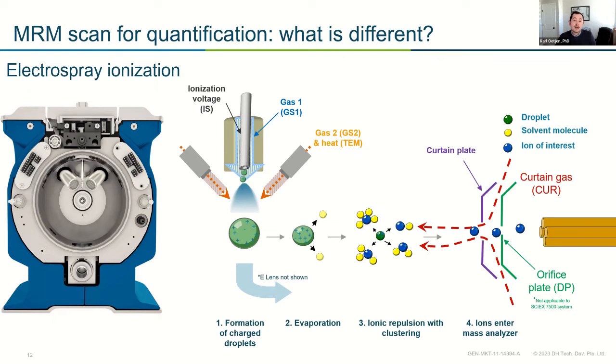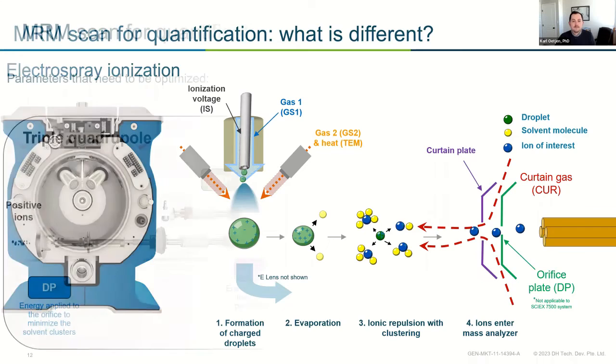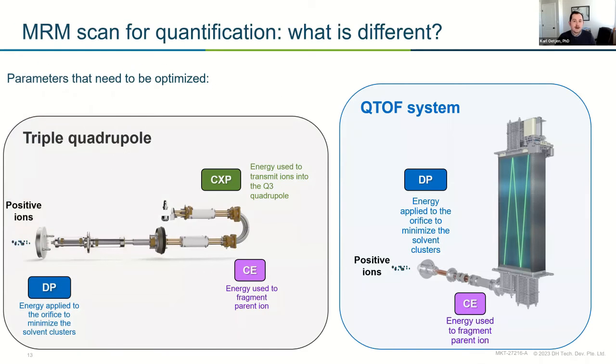If you want to dive into how to optimize those, all that kind of good stuff, check out the nominal mass series, because we go into a lot of detail there. But based on the poll results, you seem to feel pretty comfortable with that, and more concerned about what makes it different. So let's say our ions have now made it through our source. They're either about to be introduced or introduced into our instrument. What other variables are there, and what do I need to optimize for?